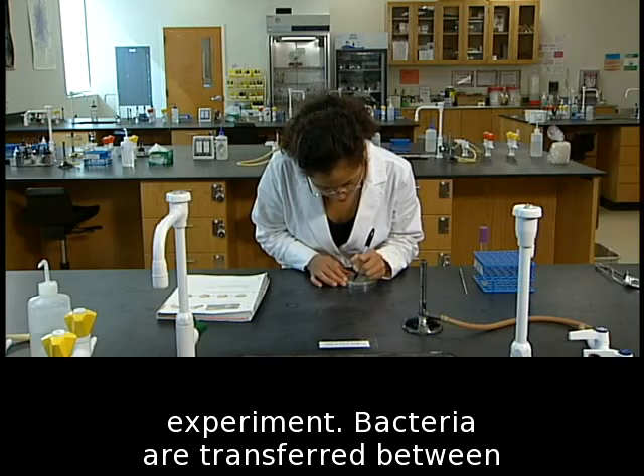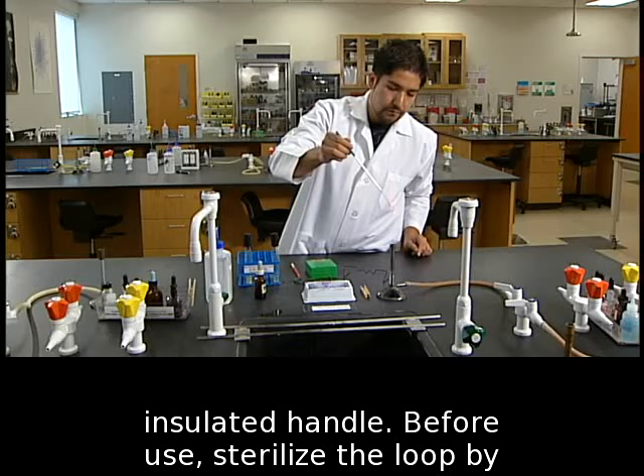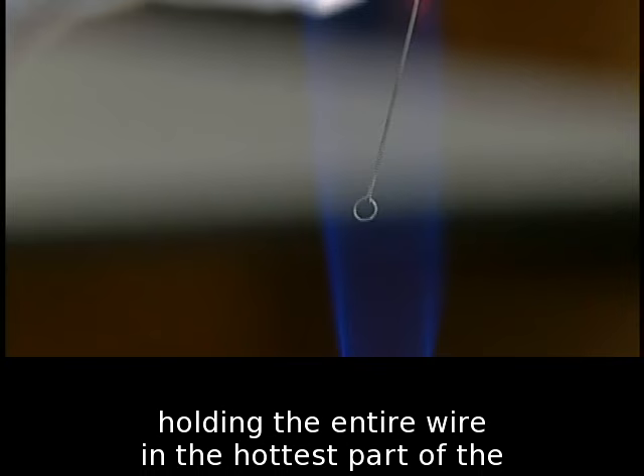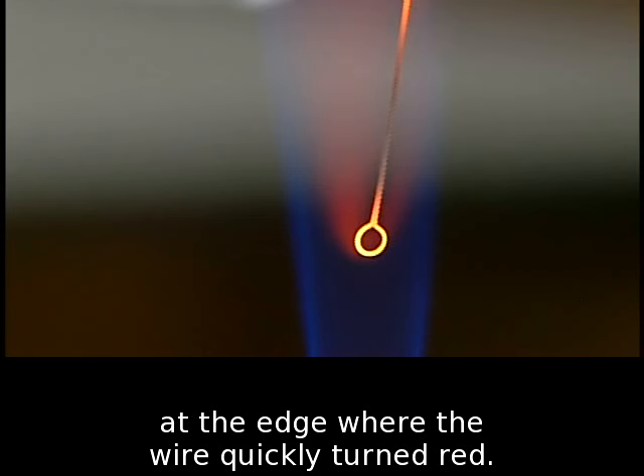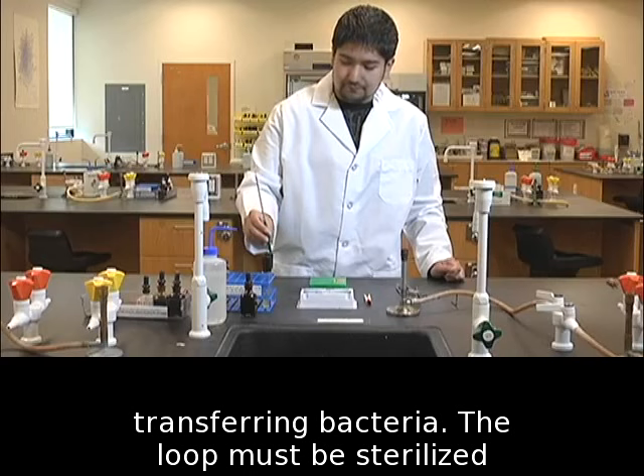Bacteria are transferred between culture media and slides using an inoculating loop — a nichrome wire held with an insulated handle. Before use, sterilize the loop by holding the entire wire in the hottest part of the flame. The hottest part of the flame is at the edge where the wire quickly turns red. Hold the loop vertically so the entire wire reddens. Let the loop cool without touching it before transferring bacteria. The loop must be sterilized before setting it down.